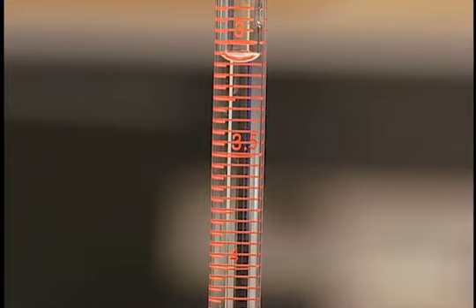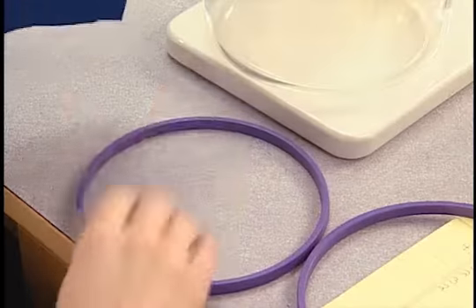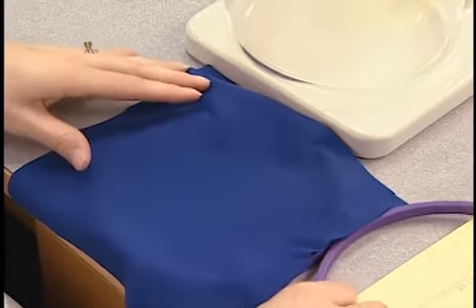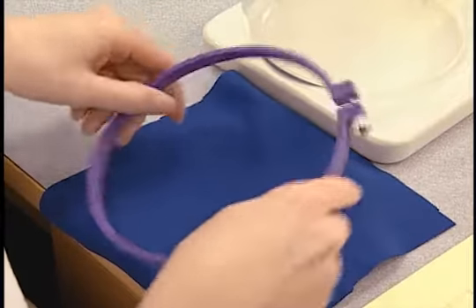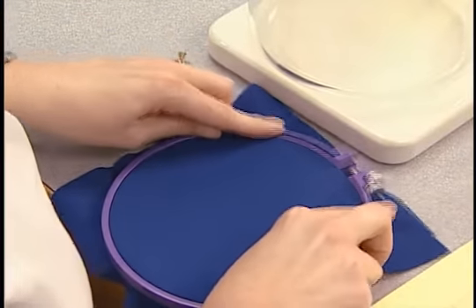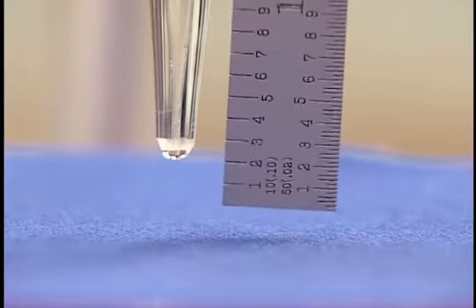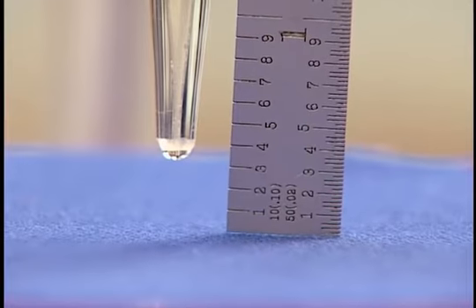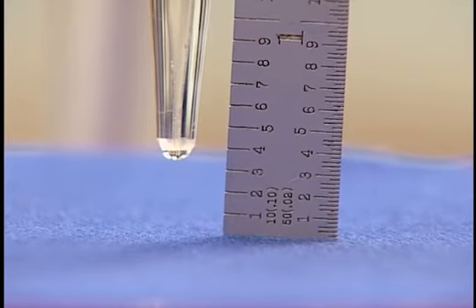A burette, which can be adjusted to deliver 15 to 25 drops of water per milliliter, is set up on a stand. A fabric specimen is mounted in a 152-millimeter embroidery hoop so that the surface of the fabric is taut. Then the mounted specimen is positioned 0.38 inch below the tip of the burette.